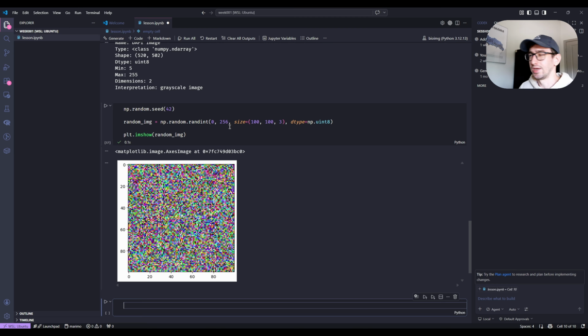Again, I want to keep focusing on this. In my mind, the real beauty of working with images is that you can right away see what's happening. Sometimes, if you analyze something numerically represented, you don't know what's happening. For example, you can work with gene expression data: you have one sample with gene expressions, and you applied some normalization tools.